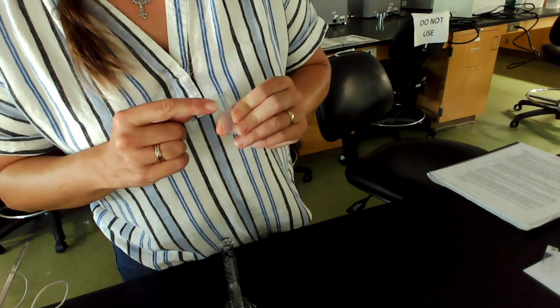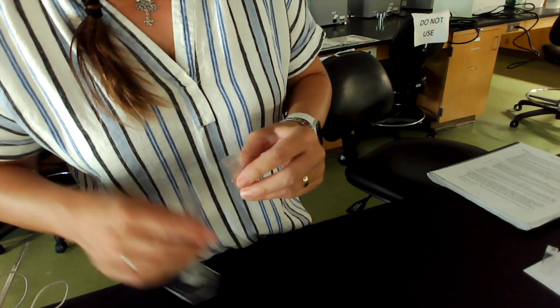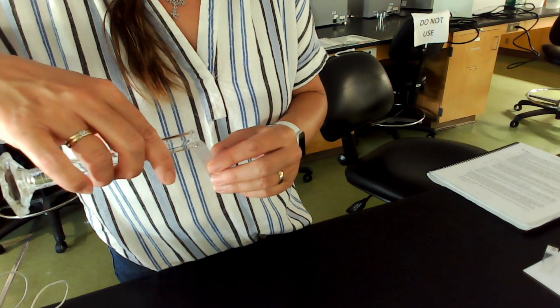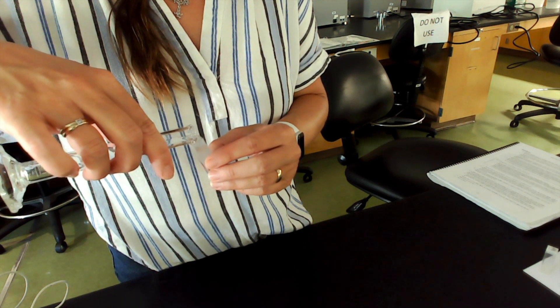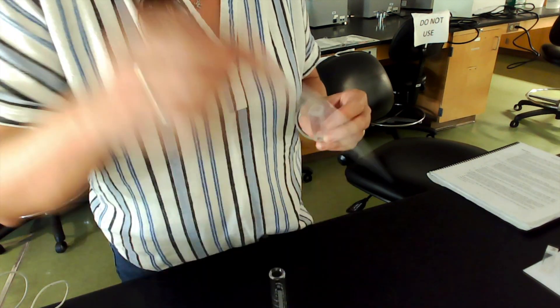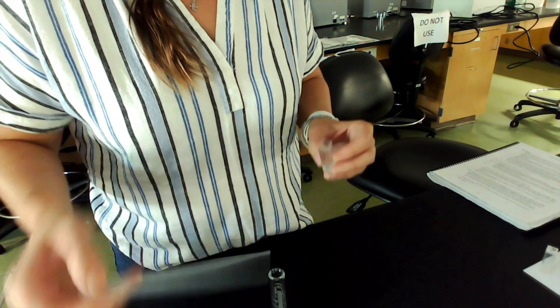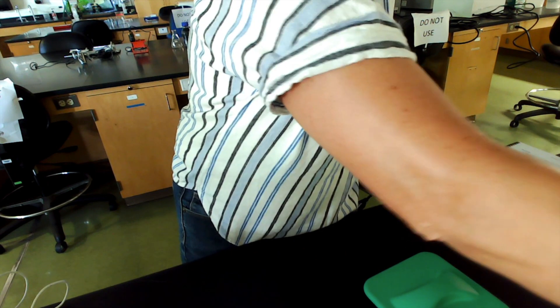It says fill this three quarters full. If this is about halfway, I'm going to try to fill it up about that much. That might be a little too much. Luckily, I have these little pipettes. Take a little bit out. This is just distilled water. Filled it up three quarters of the way full. Then I'm going to put in a couple drops of chloroplast.